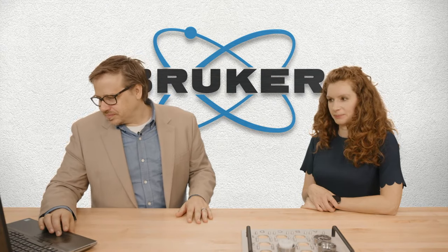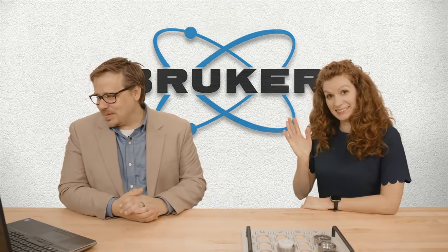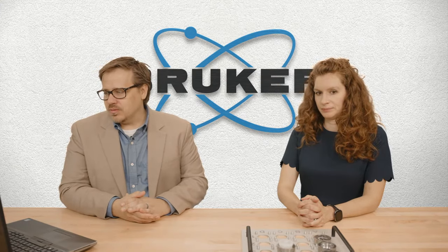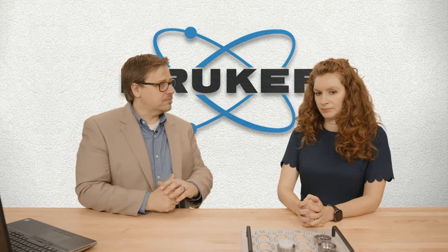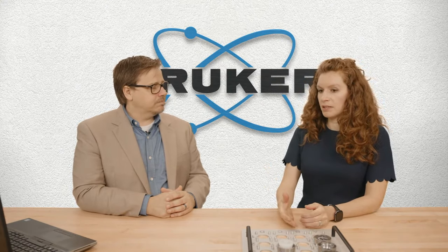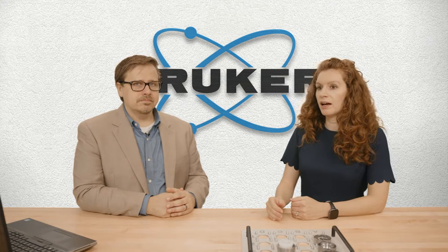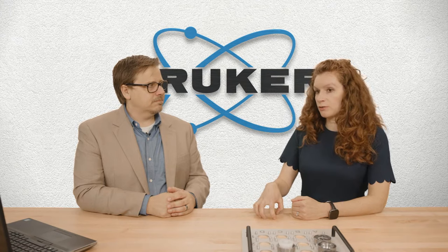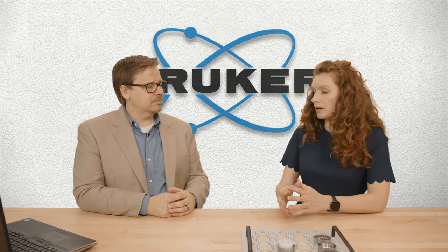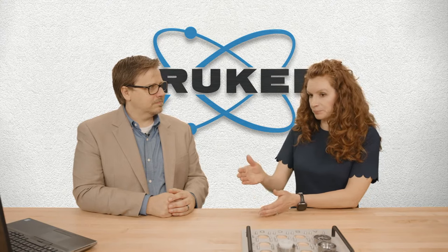All right. So let's see here. Here is the next question, and that is from a guy that watches YouTube. Is it recommended to make separate calibration curves for pressed and fused samples? Same type of sample. We have poor accuracy running pressed powders on our curve made using fused beads. Yes, definitely. You want to make sure that your calibration mimics the samples that you want to measure as closely as possible. So if you want to measure fused beads, make a fused bead calibration. And to get a step farther, use the same flux for your unknowns and for your calibration standards. That's not saying that you can't use the algorithms and the calculation power of your software to correct for that, but it's better if you can make it as close to what you're trying to measure as possible.